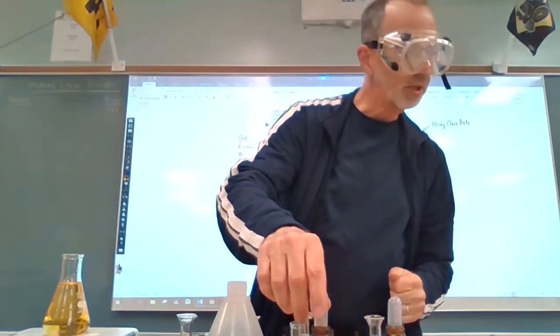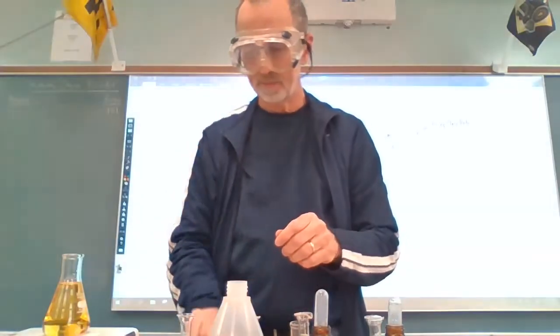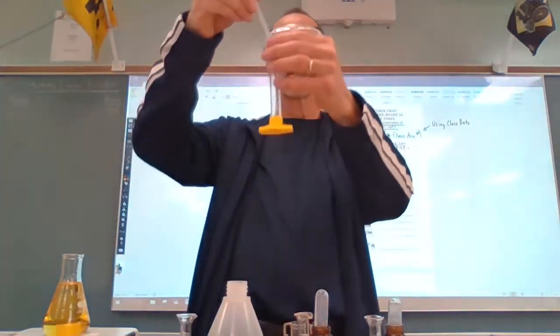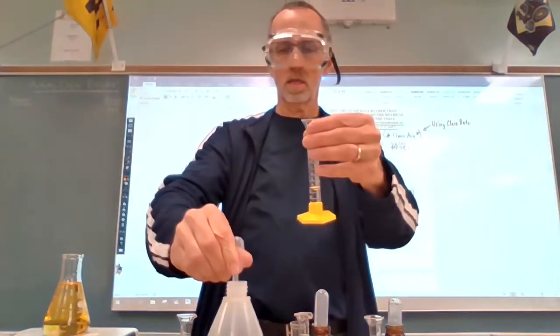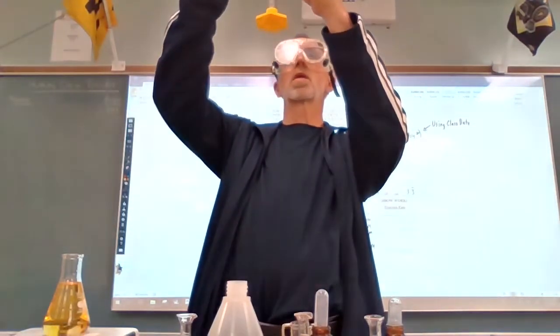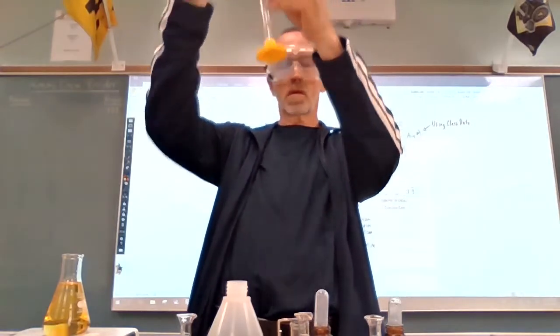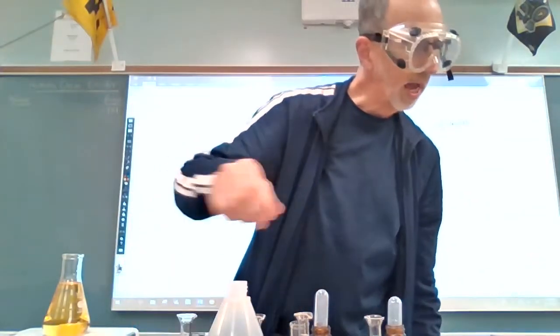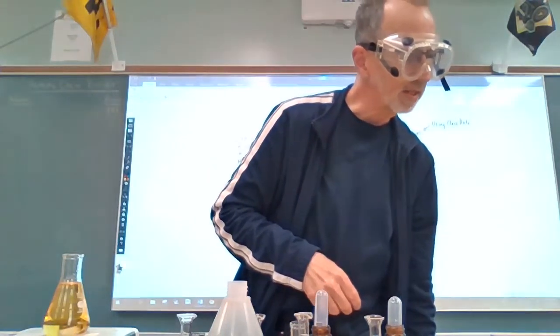Water this time, we just need 5 mLs. And iodine again this time is also 5.